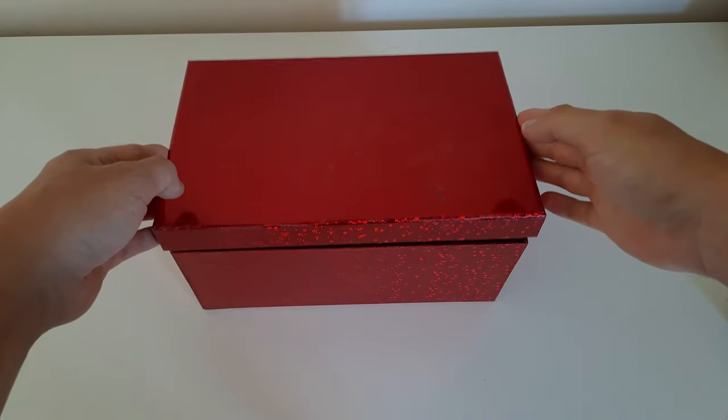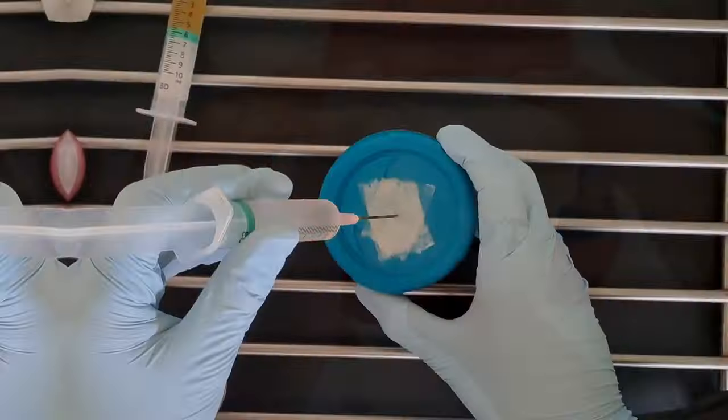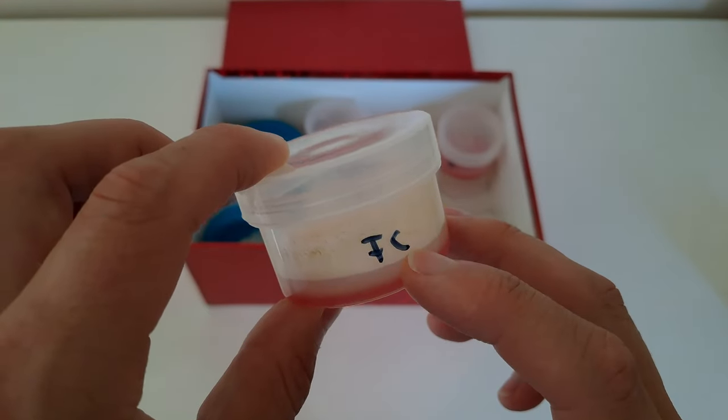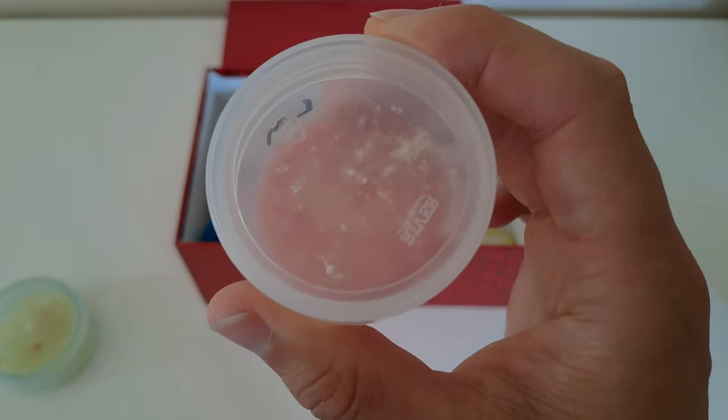In this video, I'm going to be showing you how to make little pots of agar like this. These are simple to make, very easy to inoculate, keep sterile and store. This is freckled chestnut, lion's mane, perfect for beginners.